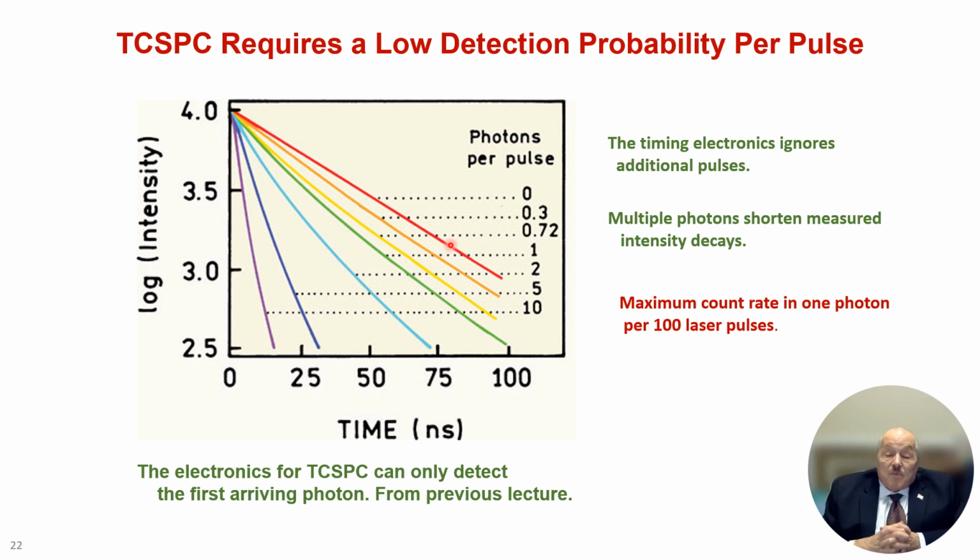So there are, in some of the company literature, claims that you can collect more than 1 photon per 100 laser pulses, but I guess you would have to prove it to yourself that that was working. Or at least I would have to prove it to myself before I would accept it, because I've seen so much pulse overlap in other experiments.